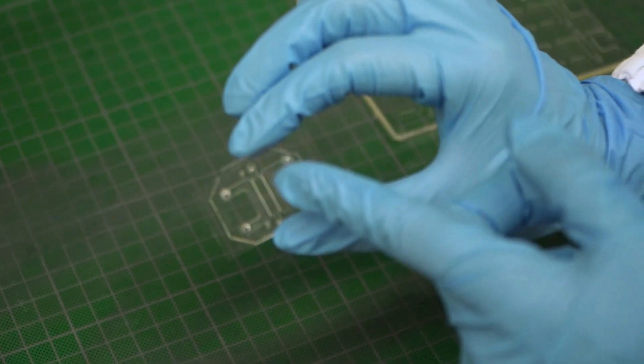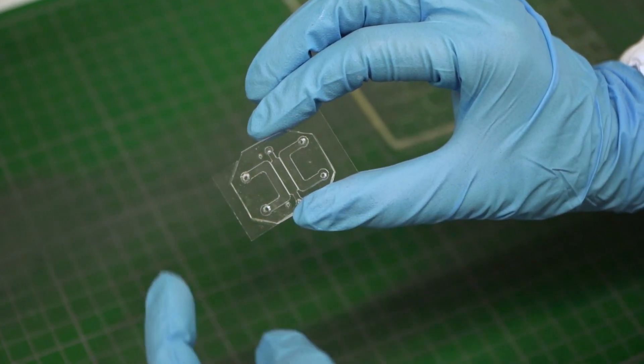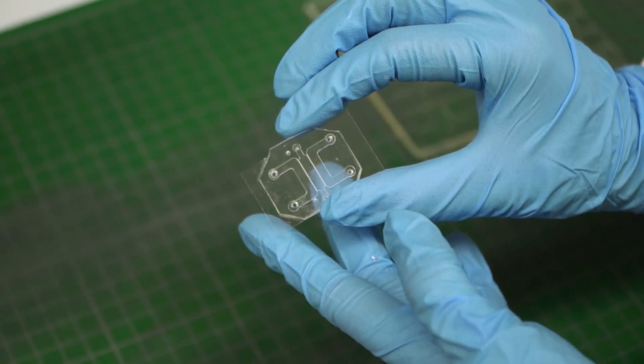Each device is composed of three channels. In the central channel we insert the cells with the hydrogel and here they will form the vessels in 3D.